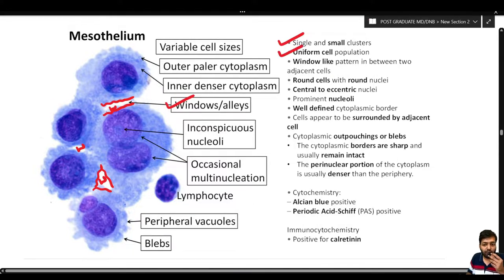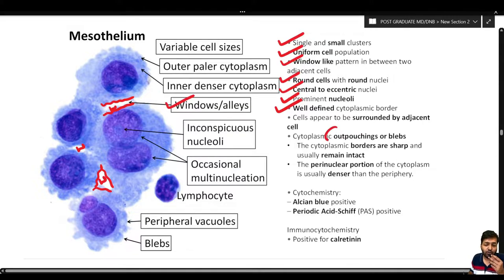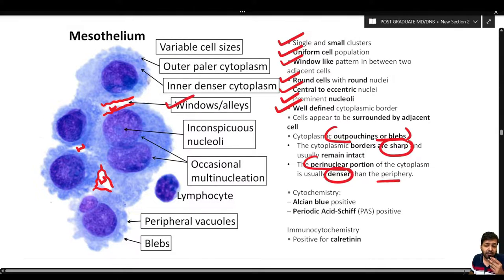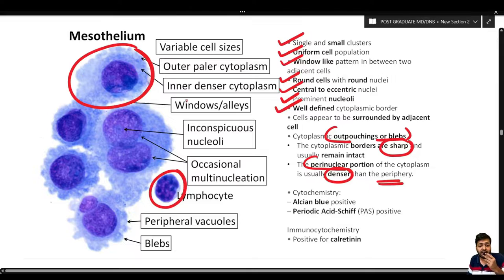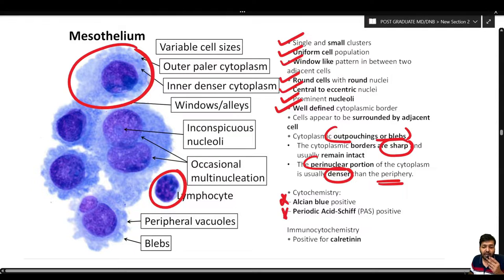Mesothelial cells can be present singly or in small clusters as a uniform cell population. The window-like pattern can be appreciated between adjacent cells. These are round cells with round nuclei, central to eccentric nucleus, and prominent nucleoli, with a well-defined cytoplasmic border that may show cytoplasmic outpouchings and blebs. The perinuclear cytoplasm is denser compared to the periphery. Mesothelial cells are larger than lymphocytes and have more cytoplasm.